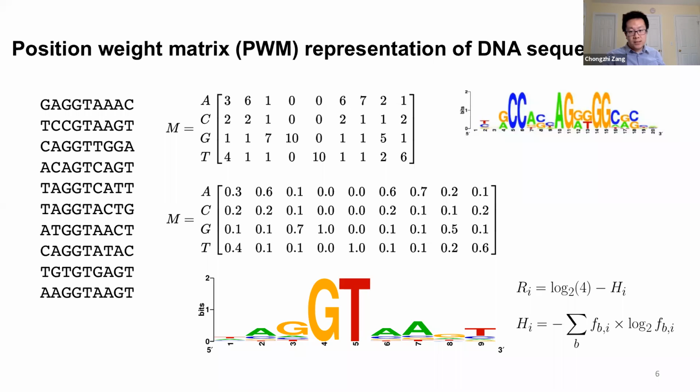Number one, this is of course another layer of quality control. If we ChIP a known transcription factor and want to make sure that the peaks identified from the ChIP-seq data are indeed the binding sites of that transcription factor, then we should assume that the known sequence motif of that transcription factor can be identified from the peak regions. That means we indeed identified the real binding sites.